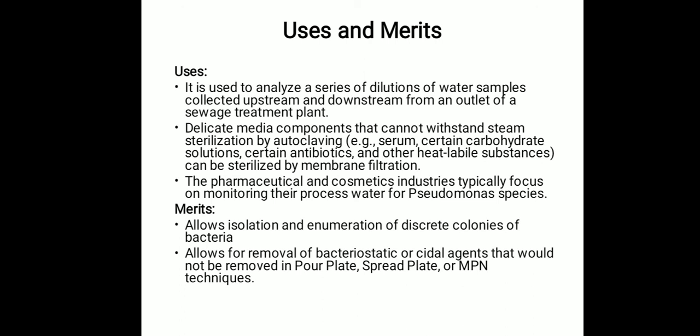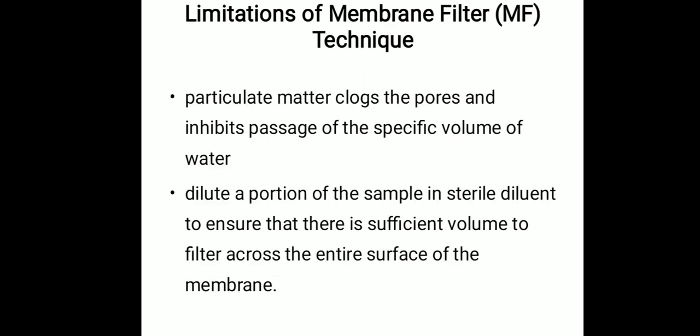What are the limitations of this MF technique? During the processing of turbid specimens that contain large quantities of suspended materials, particulate matter clogs the pores and inhibits passage of the specific volume of water.